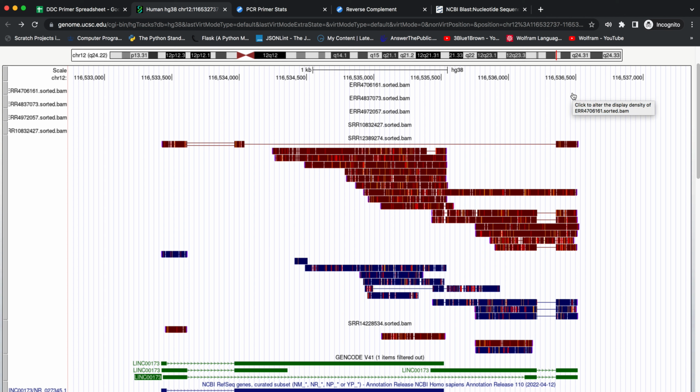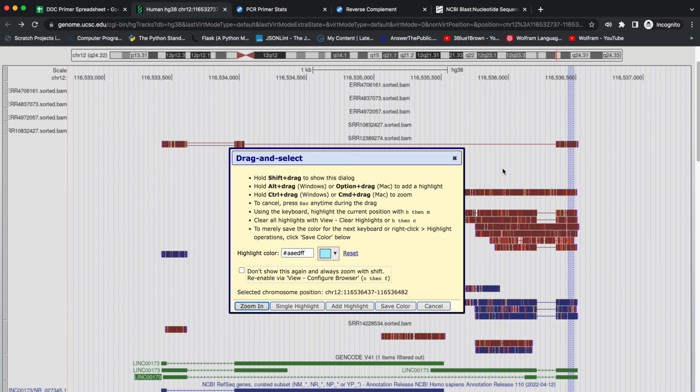The longer, the more complex, the more optimization that needs to go into the experiment, as in the number of tries that you need to do with the PCR goes up. So in order to design the reverse primer, we'll pick some region here at the back so that the insert is about 200 base pairs.